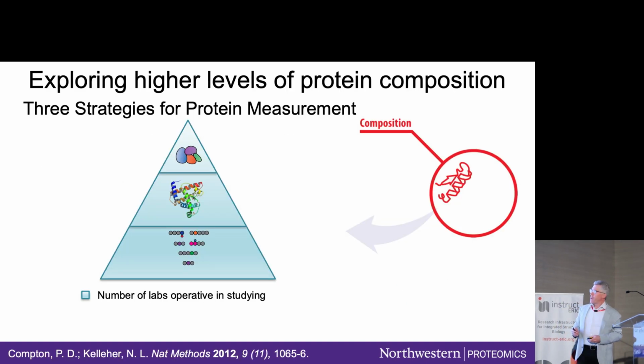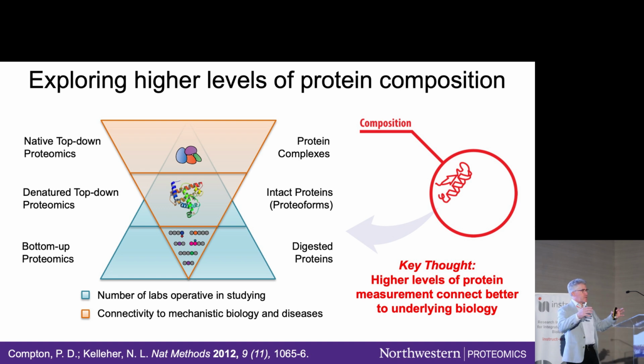So here I'll give you a framework how to think about this. Bottom-up proteomics, that's of course the domain of trypsin digestion largely, or other proteases. And yes, it has become quite general, quite well maturing now into the 2020s, all the way from its origins in the 90s, right? That's 30 years running a 4 to 5 billion euro a year market to develop that technology in all of its incarnations, including like BioID, TurboID, proximity labeling. That's just one offshoot. Cross-linking we saw a little bit. All of those technologies are amazing, and wouldn't have had it any other way. Great for discovery of PPIs or creating data sets that are scalable, useful, understanding the logic of how cells function.